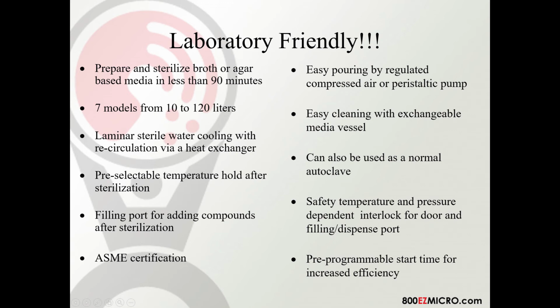The ASME certification, which is quite important. You will get a U1A document with every Systec MediaPrep instrument that will verify the ASME status.